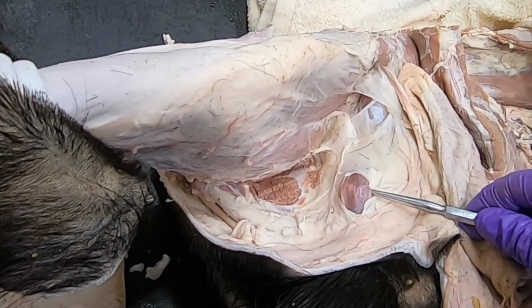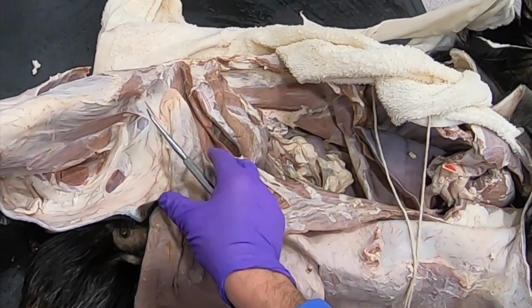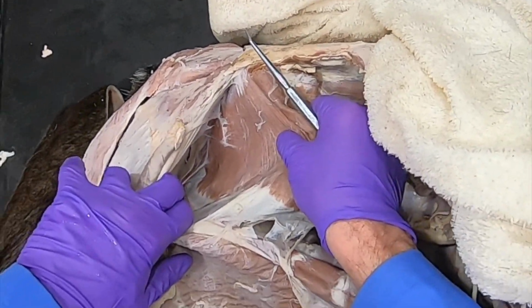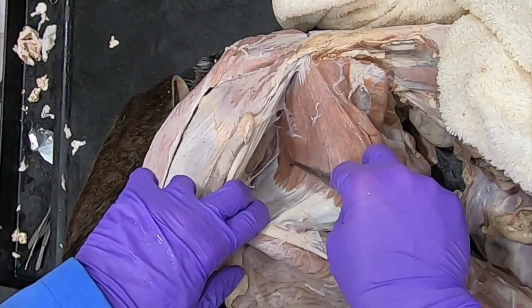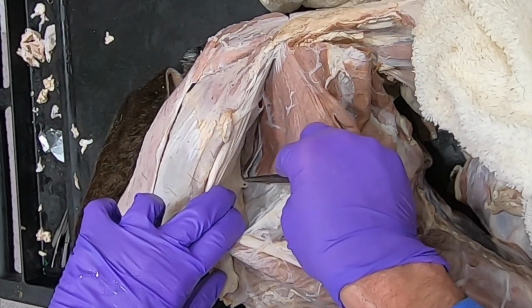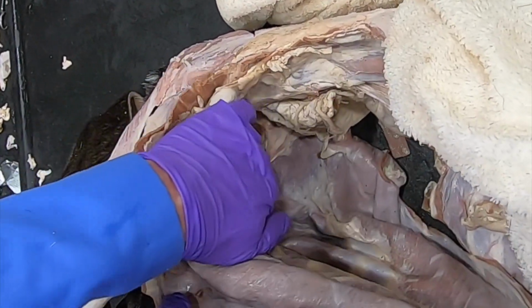We can see the spermatic cord here with a very prominent cremaster muscle. So remember that cremaster muscle is going to be coming from the internal abdominal oblique. So we have our external abdominal oblique, our internal abdominal oblique, and if we look down in here, hopefully you can see the caudal border of that internal abdominal oblique. It's got a segment that is going with the spermatic cord out through this superficial inguinal ring in the aponeurosis of the external abdominal oblique. Okay, we take that on in here.